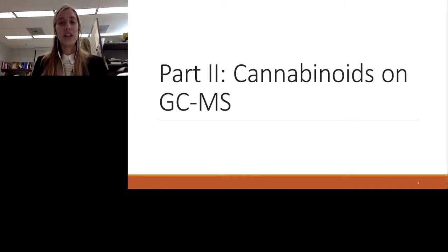So now I'm actually going to start talking about the projects that we did throughout the program. So the first part is the analysis of cannabinoids on GCMS. So we saw earlier why cannabinoids are important to be studied. And I mentioned the trace analysis. So this type of method will actually give extremely low limits of detection. And for this reason, this method is not suitable for potency testing. We have used it for trace analysis, and so to check whether other components were found in CBD oils or in other types of extracts.